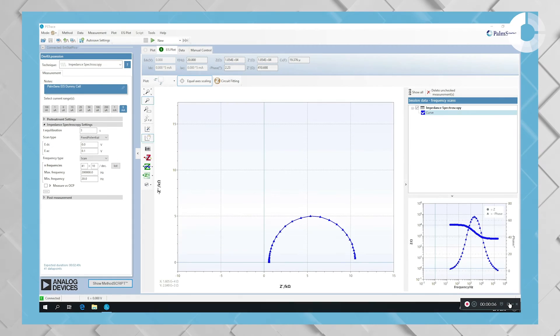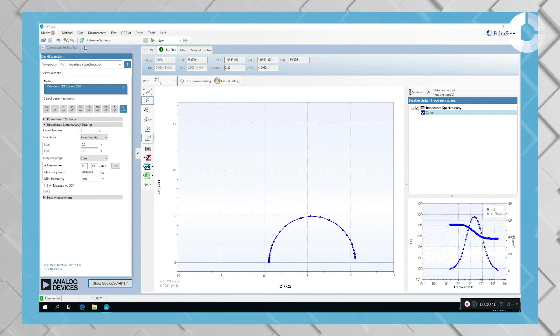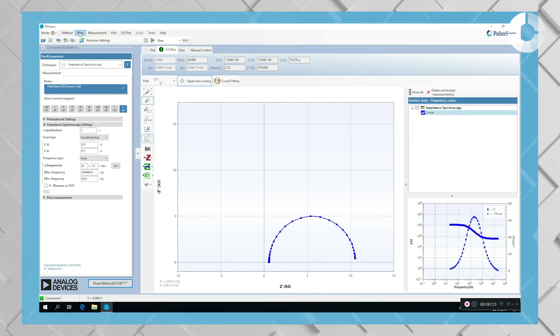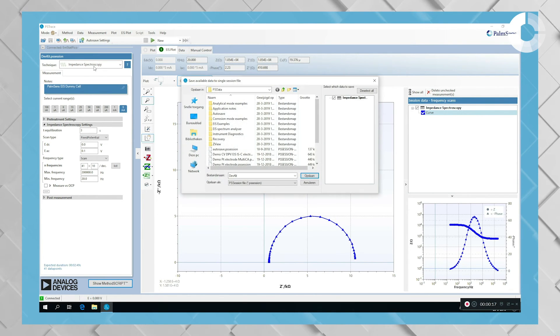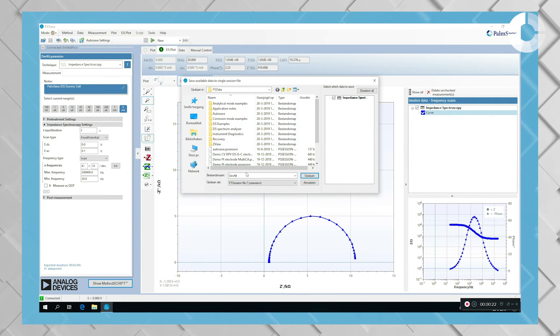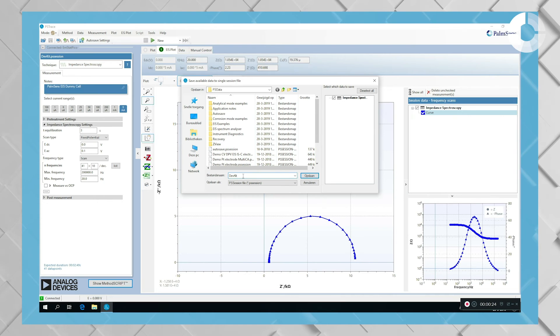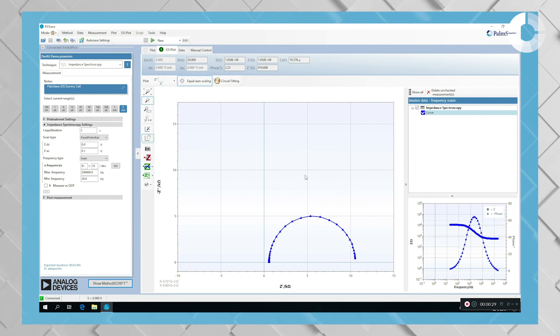After your measurement is finished, you can easily save it by going to the top menu to the data button and press save data. And then choose the folder where you want to save your data, enter a name, demo for example, and save your file.